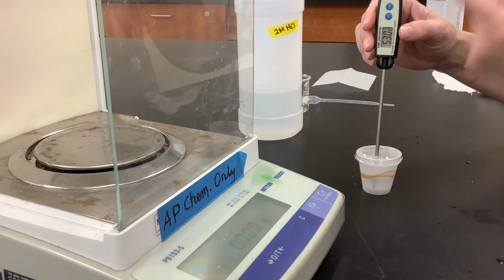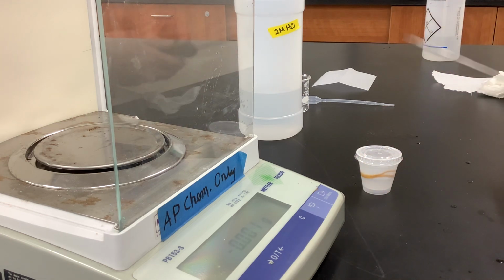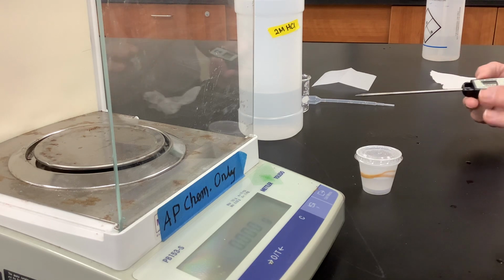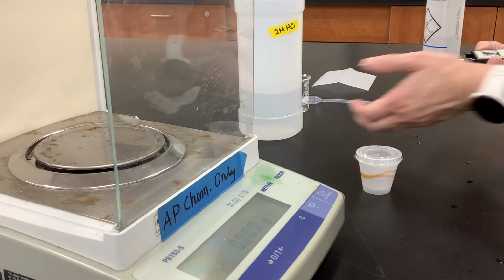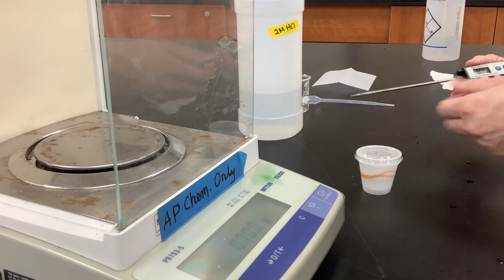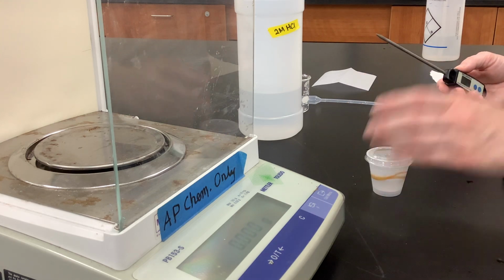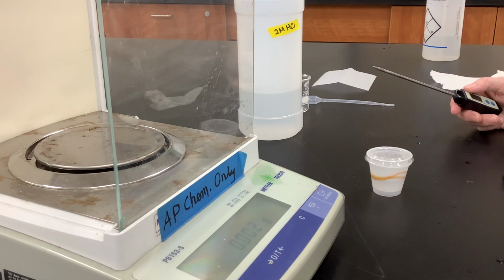Okay, and now we basically clean up. Okay, rinse down the surface of our thermometer before we put it away. We don't want a bunch of reactants and products stuck on the surface. So we're going to rinse that down with the deionized water, dry it, put the cap back on. We're also going to rinse this out just like we have in the past several trials, put it in the right waste container, put all our glassware away, and basically move on.